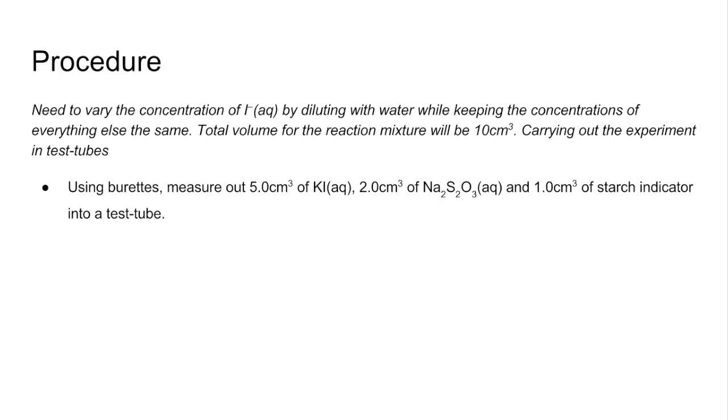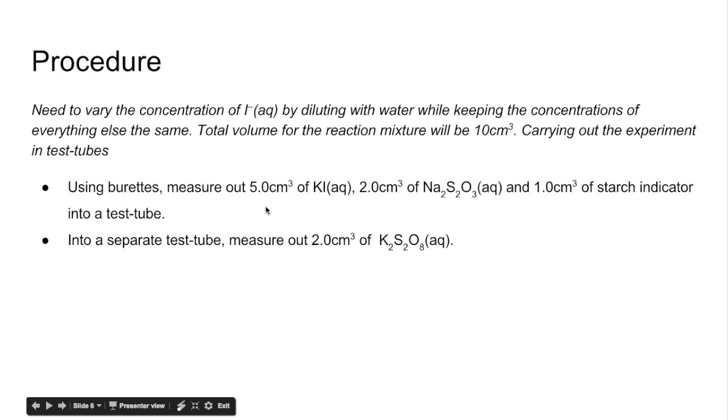Into a separate test tube, I'm measuring out 2 cm³ of the potassium peroxodisulfate solution. In this test tube we've got 5, 2, and 1, so that's 8 cm³, and we've got 2 cm³ in the other test tube. So there's my total volume of 10.